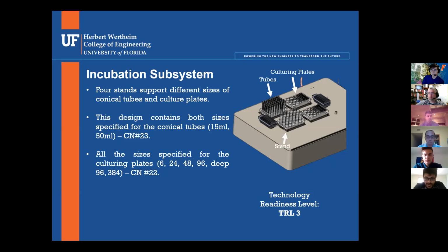The incubation media will be held still in different stands, where each stand was designed to hold the tubes and plates steadily and secure them in their position while the actuators are vibrating the whole system. The stands are made of acrylic in order to let the light pass through it and then through the incubation media for the FI and OD readings.